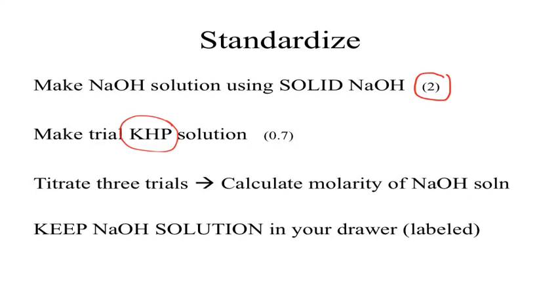Okay? You'll go through, I know that says 3. We'll do 2 per partner. If you're good with your timing, this is how we can get out of lab faster, because each partner will be doing the titration simultaneously. Okay, so you'll go through the experiment a little bit faster.